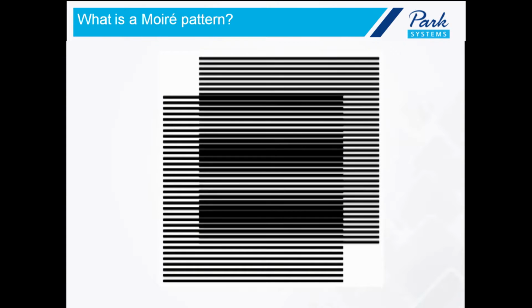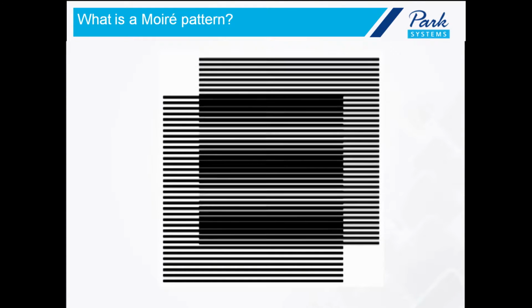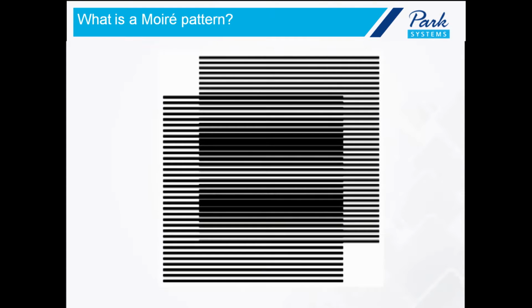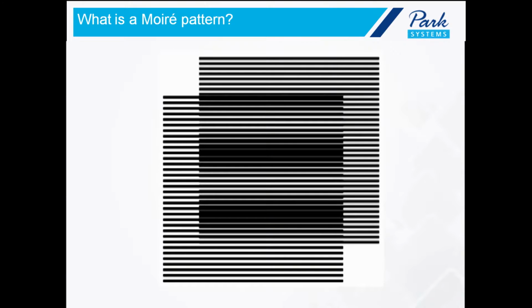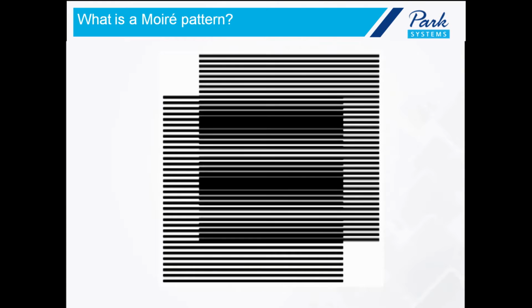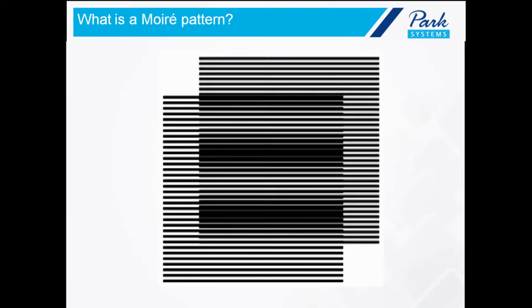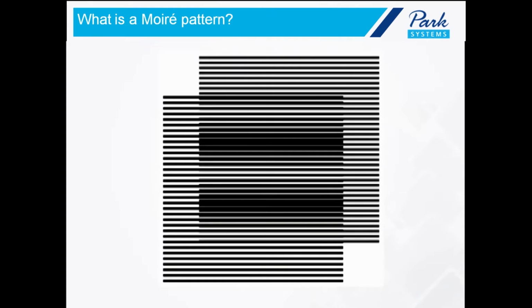As your visual perspective changes, maybe as you're walking down the room, and you look at those screen doors overlapping one another, you'll notice a visual pattern wherever they overlap that is only visually evident. It's not actually there. This is what the animation is trying to simulate, and this is essentially the type of feature we're trying to characterize on our sample surface. We have a monolayer of graphene that's been grown on top of hexagonal boron nitride. Those are our two layers.